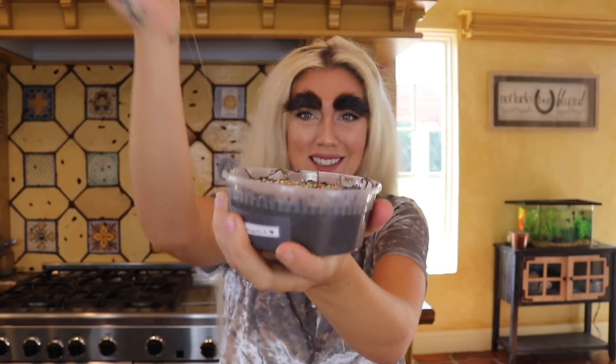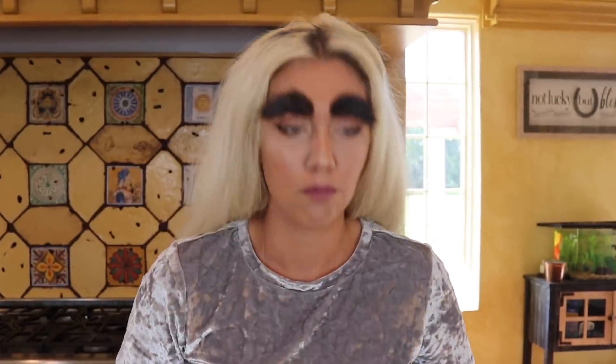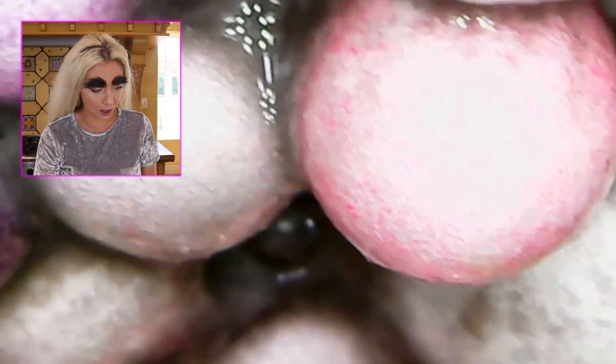Let's open up this slime smoothie and check it out — it smells like a million different things. Here is an up-close personal view of what floam beads look like. Look, there's a fiber right on that floam bead, there's a hair on that floam bead. I think we're going to find like some bugs, some spiders. The funniest part about this slime smoothie is that it's black and has rainbow floam beads in it. This looks so weird under a microscope. What a floam bead looks like 1,000 times magnified — I can't even see that stuff that the microscope picks up. The slime really doesn't look too gross, it's just black.